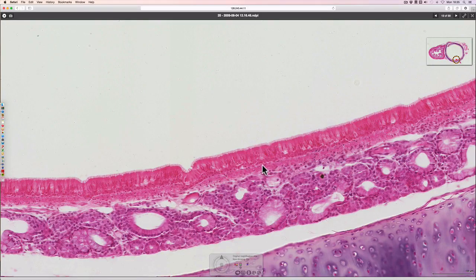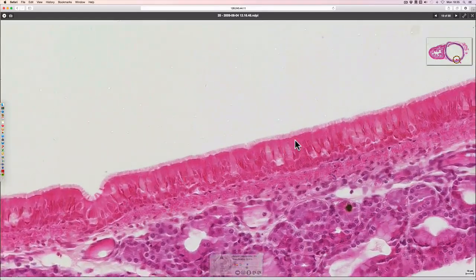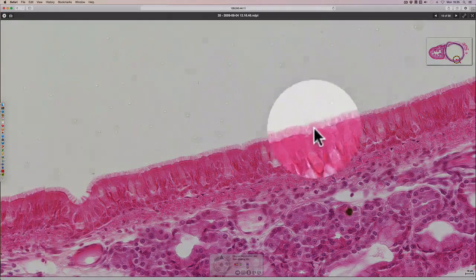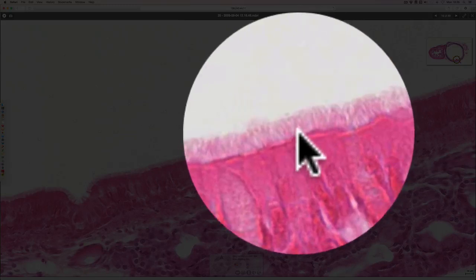The basement membrane is here. There are some tall columnar cells — you can see the nuclei there. At the surface of those cells we can see some long things protruding out from the top, and these are cilia.